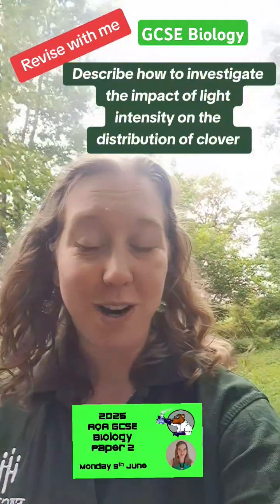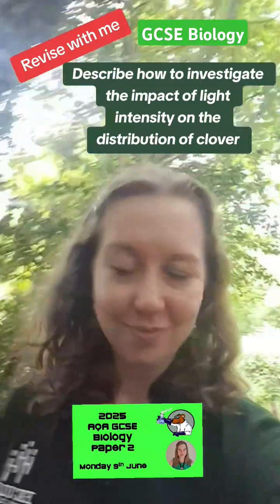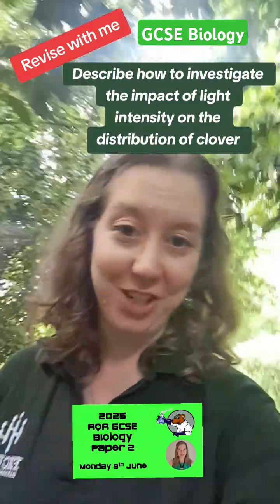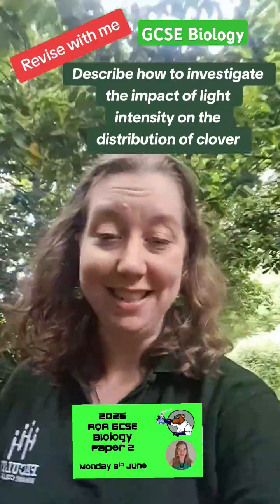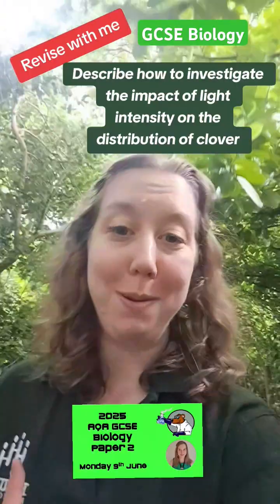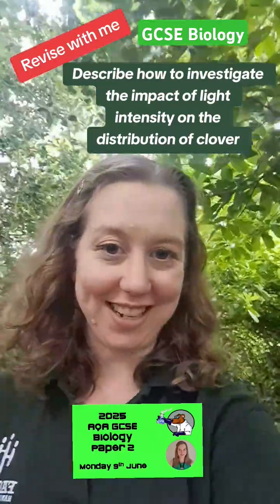In this sampling required practical, you're going to have to use a quadrat. This is a square or rectangular frame with or without internal divisions that you're going to put down in different places and see: is the clover there or not? Depending on the exact wording of the question, you may be doing random sampling or transect sampling.